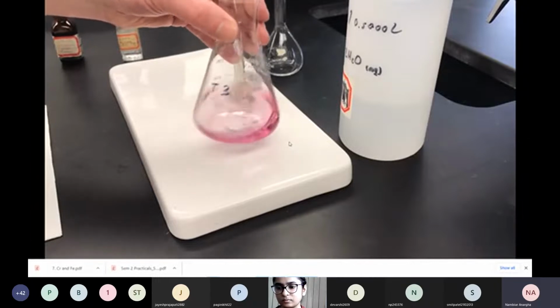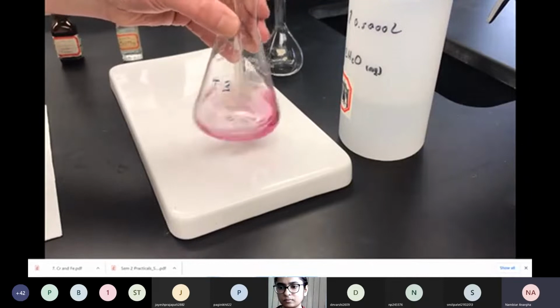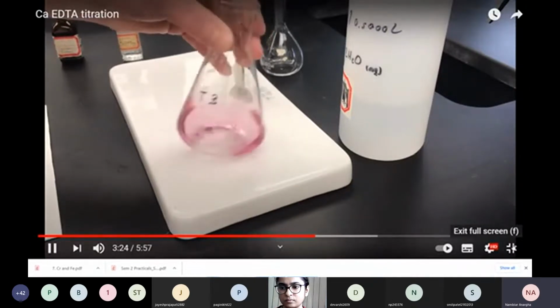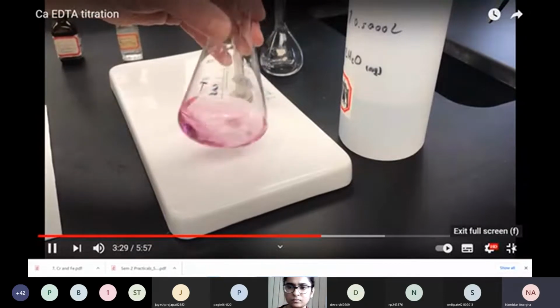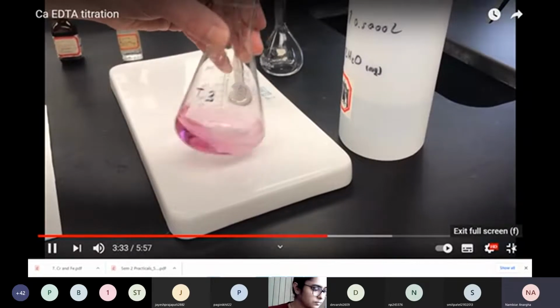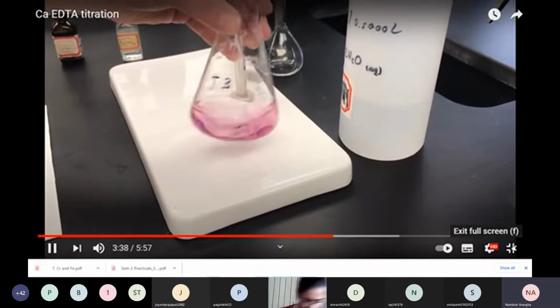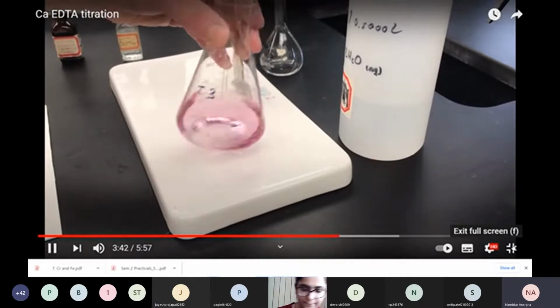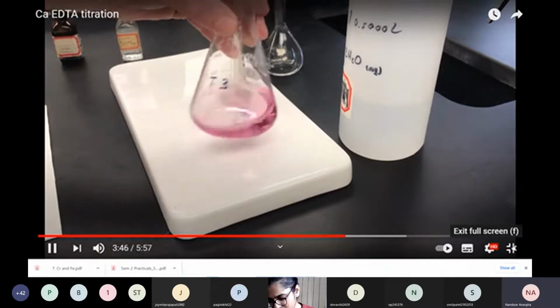So far you really don't see much of a change or any change in color, and that's to be expected. Now what we're looking for, again, to remind ourselves, is we want to see a transition from this pinkish color, reddish pink, through a purple, and then ultimately to almost a sky blue. So that's what we're trying to get in this titration. So we're going to come down to about 15.5 mils, and then we're going to sneak up from there. We have a little bit of ways to go yet. Okay, we're almost there.